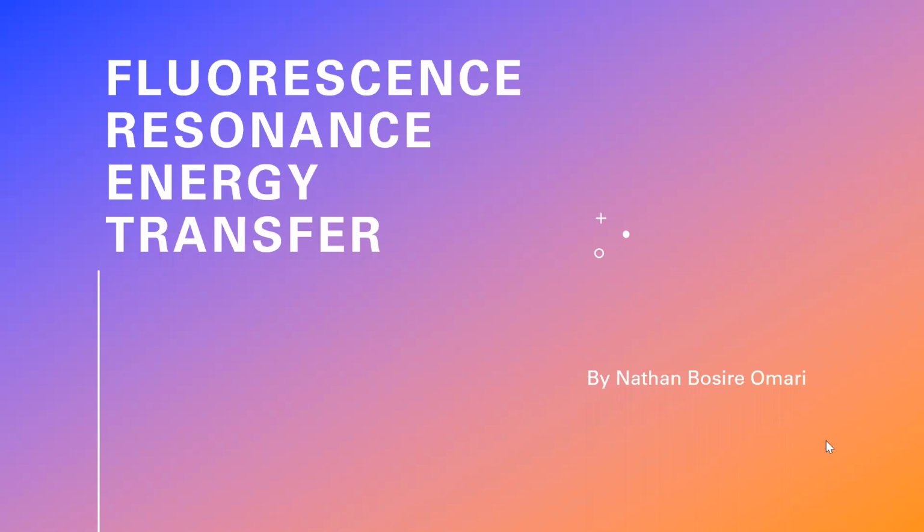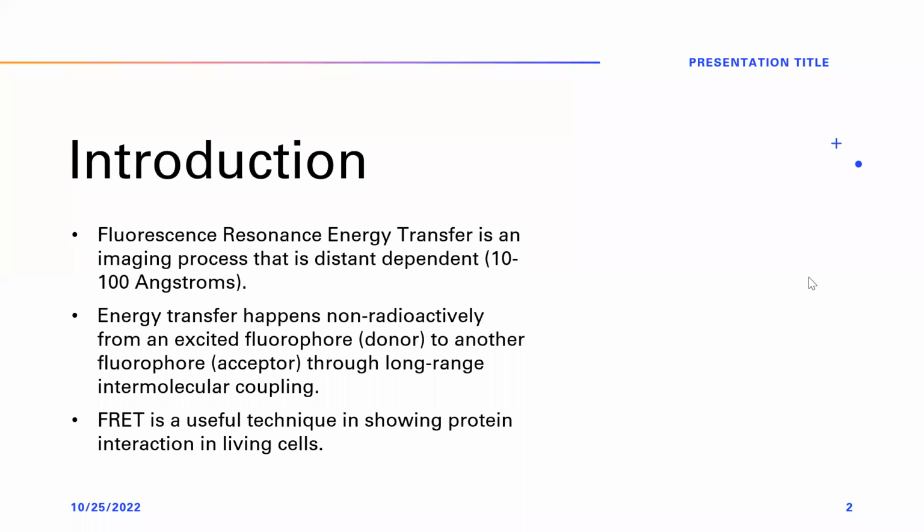We are looking into the fluorescence resonance energy transfer technique. It's also known as the FRET technique. So FRET, this is the introduction. FRET is an imaging process that is distance dependent.